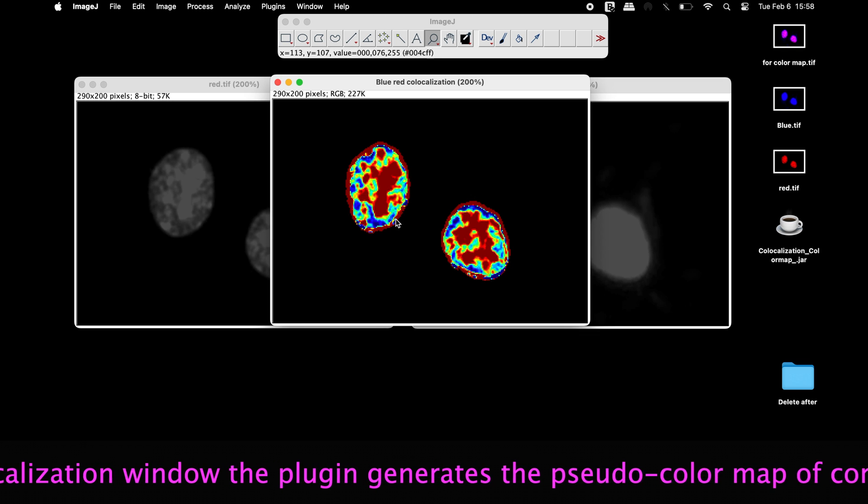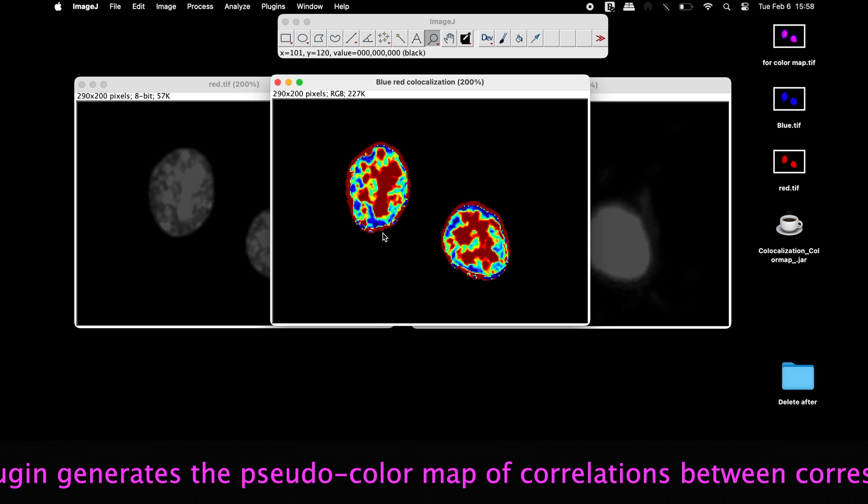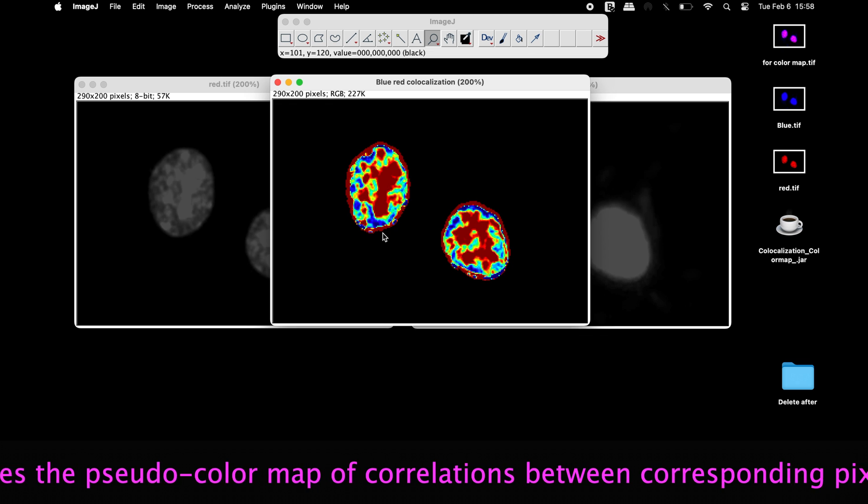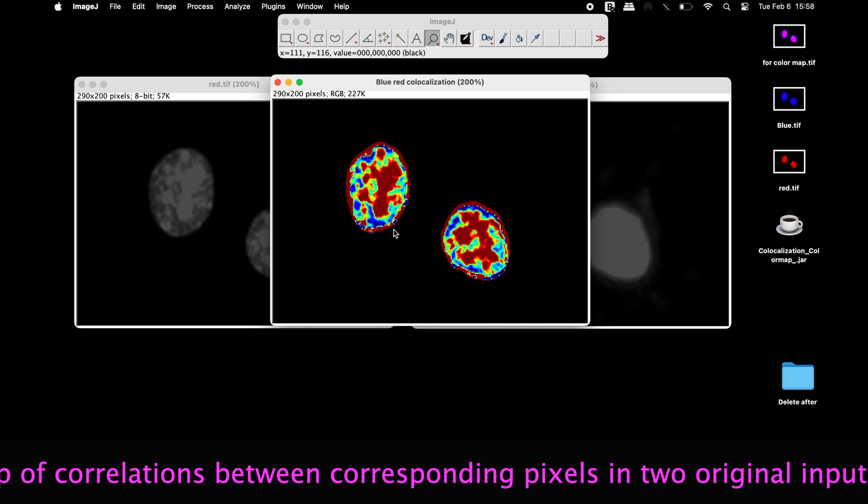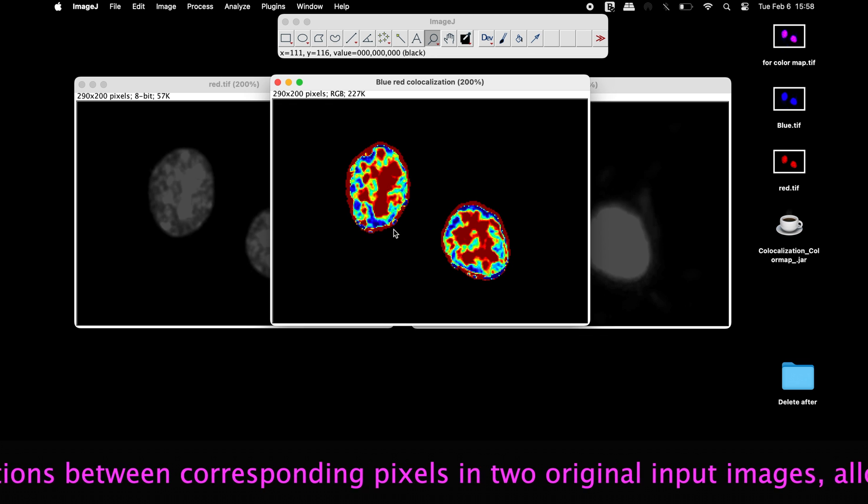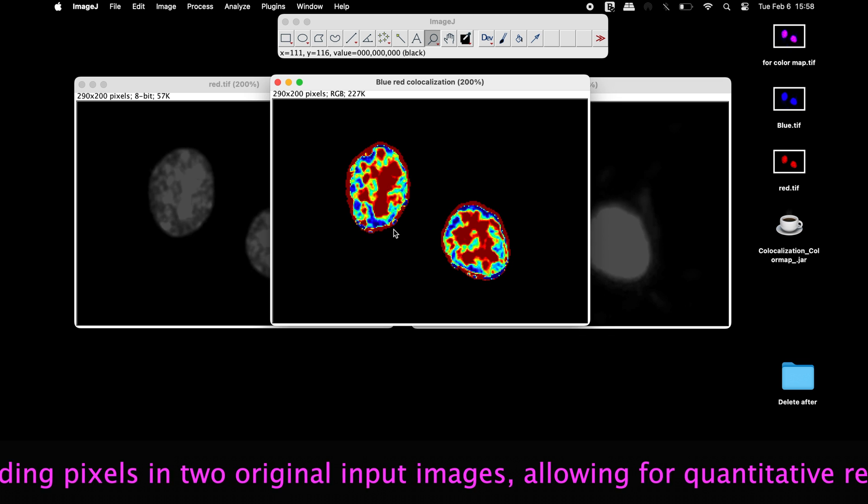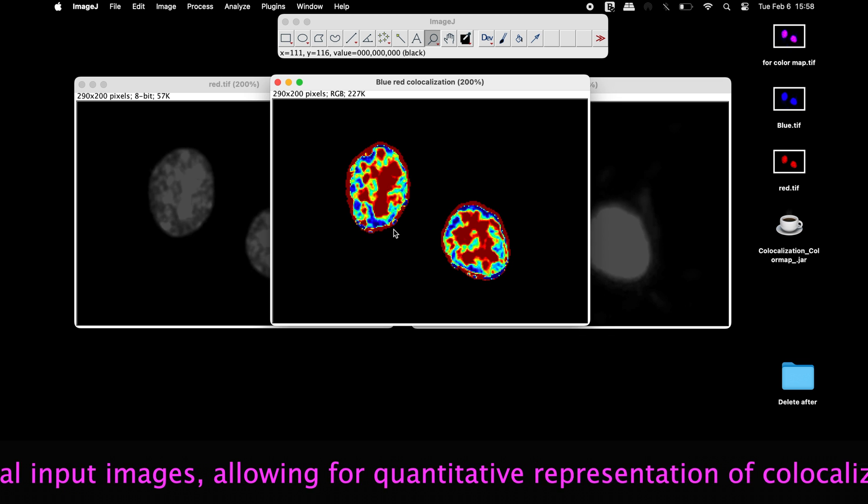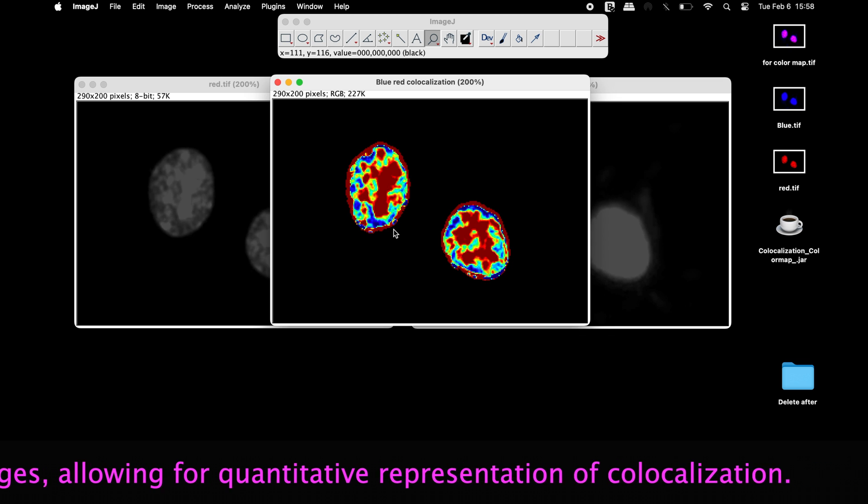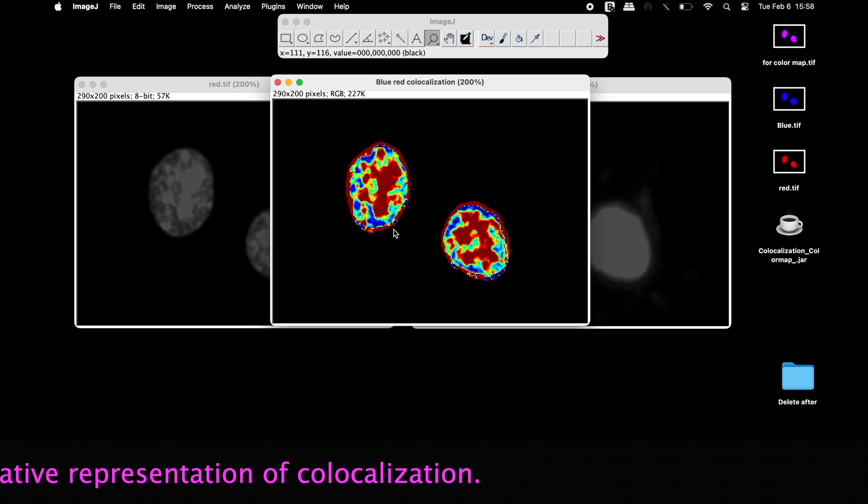In the co-localization window, the plugin generates the pseudo color map of correlations between corresponding pixels in two original input images, allowing for quantitative representation of co-localization.